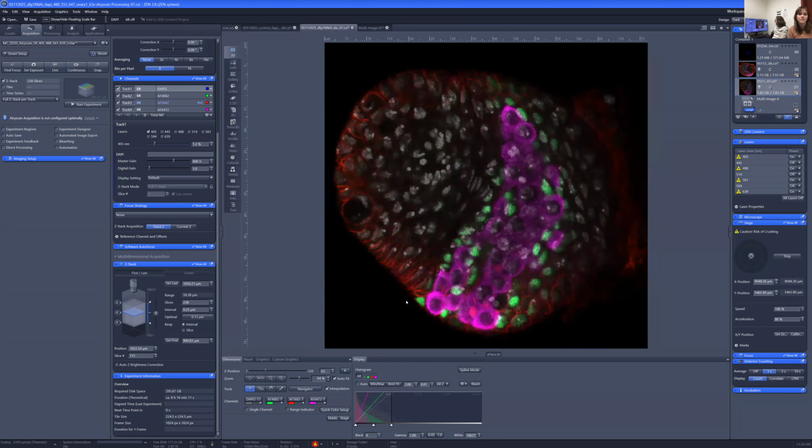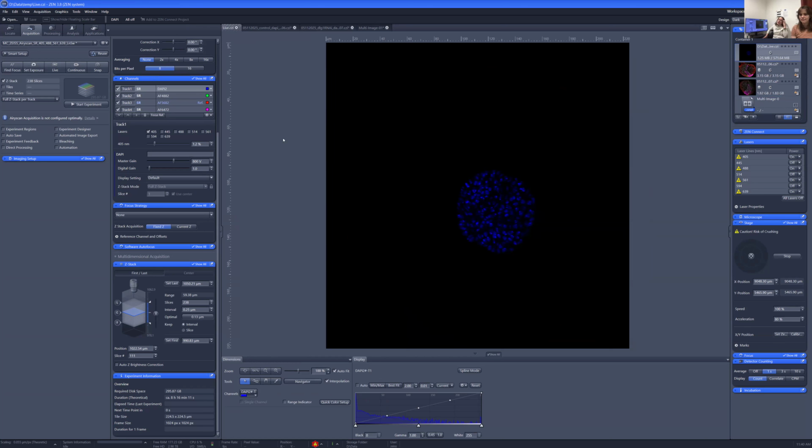And what I'm imaging with you all today is the control. I always do the control first in my experiments, just so that I know that the control samples look really good. Because if there's something wrong with the control, you can't really interpret very much from your experimental samples. So before getting too excited about experimental samples that I then can't end up using, I always image my control first. So hopefully these images look nice.